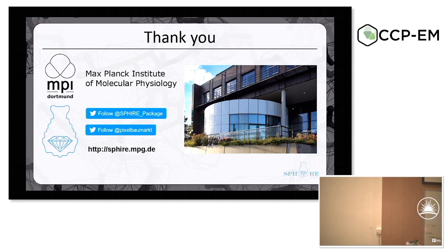So as the size of your generalized model increases over multiple data sets, is there much overhead when you're running crYOLO? Because your model is... The computational part is the same. Of course, the training will last for a longer time, but I train the general model for you. You don't have to train it. As I told you, 50 data sets, each 20 images. It takes a while. I train for 1 day roughly, but the user doesn't have to do it, right? The user typically trains on, let's say, 20 images. This is fast.